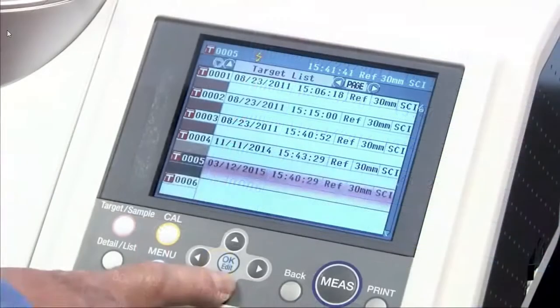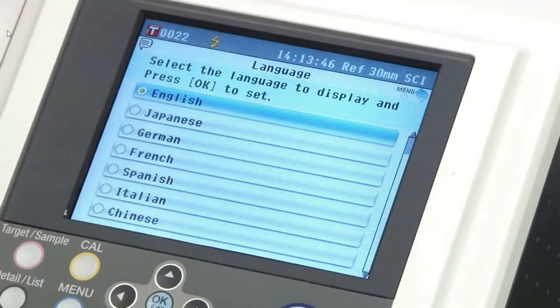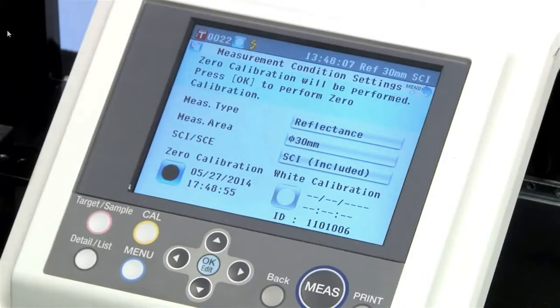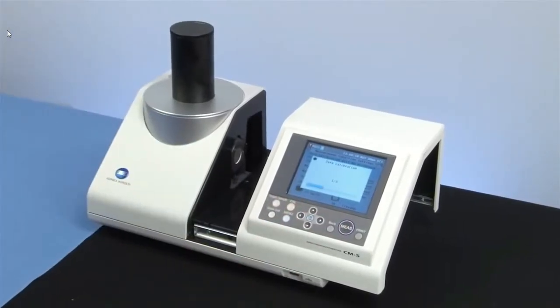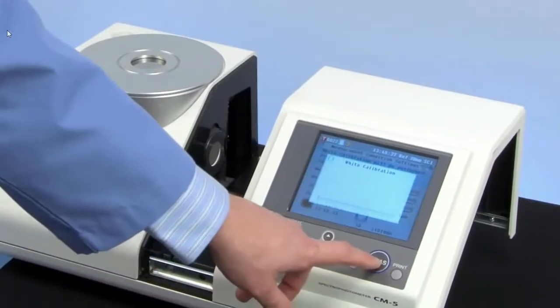To begin, switch the instrument on and perform zero calibration, then white calibration before each color measurement session. There is also an option to perform white calibration automatically. After calibration, place your sample on the top port or in the transmittance chamber.